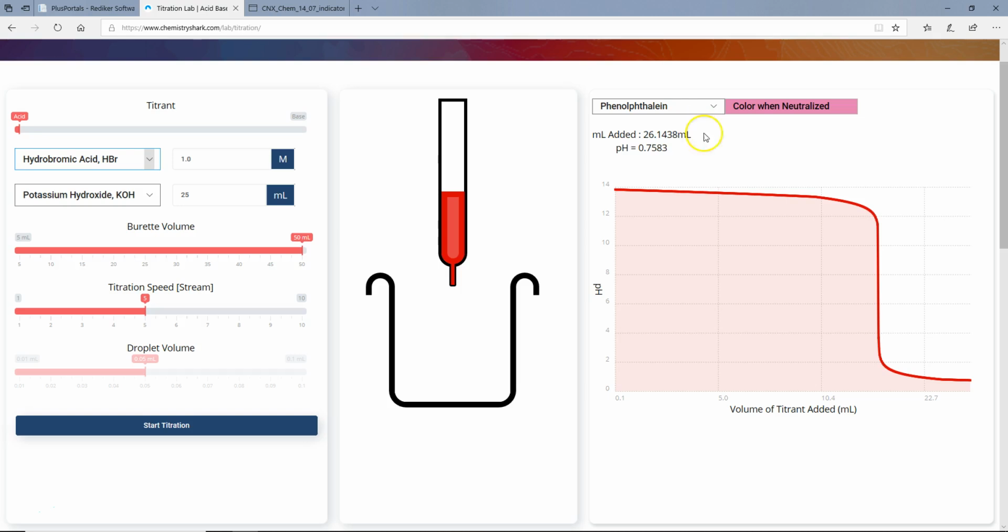Typically, I should see some different numbers here for everybody, because no one's going to just do it precisely exact. So if I see everyone has the exact same thing, that's going to make me have my little radar up of, hey, did you really do this, or did you just say, hey, can you print me off 4 copies so that me and 3 other people can do this and not have to deal with it. So do it yourself. Be honest.